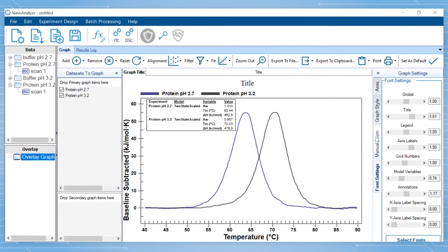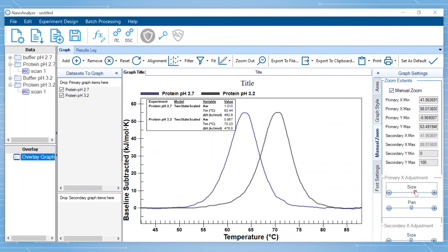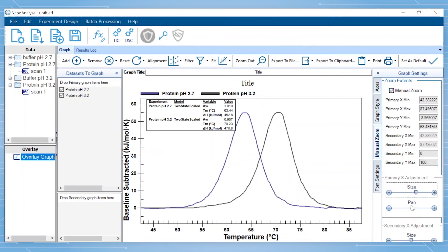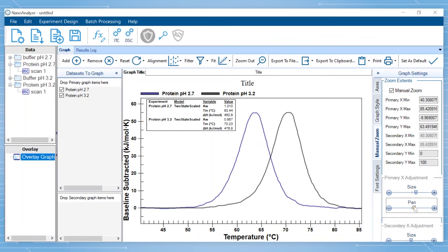Under the Manual Zoom tab, the scale for the X and Y axis can be modified if needed. You can also select Manual Zoom and use the slider bar to zoom in or out and to pan to place the graph in the desired spot.